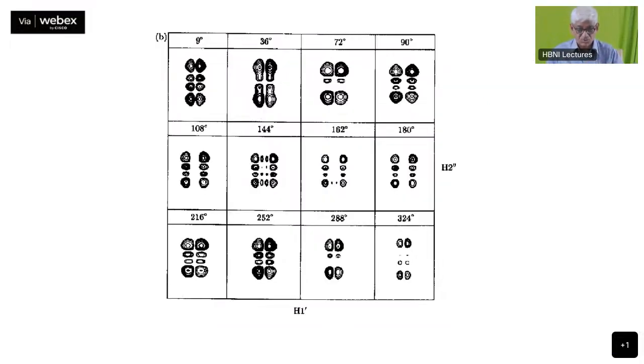Okay. I'm showing you here the various kinds of patterns you will get in these various cross peaks in the COSY spectrum, depending upon the sugar geometry. This is the 1' to 2'' here. You can see quite a substantial variation in the fine structures of the individual peaks and the intensities of the various components here. This is because of the cancellations. Cancellations will happen depending on the coupling constants, and the coupling constants are varying, as I showed in the previous slide there.